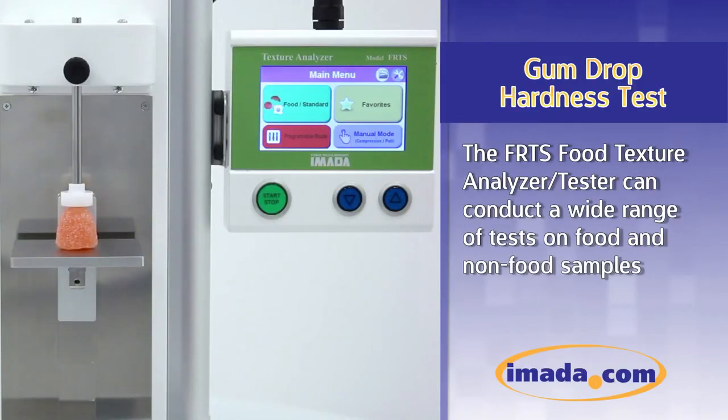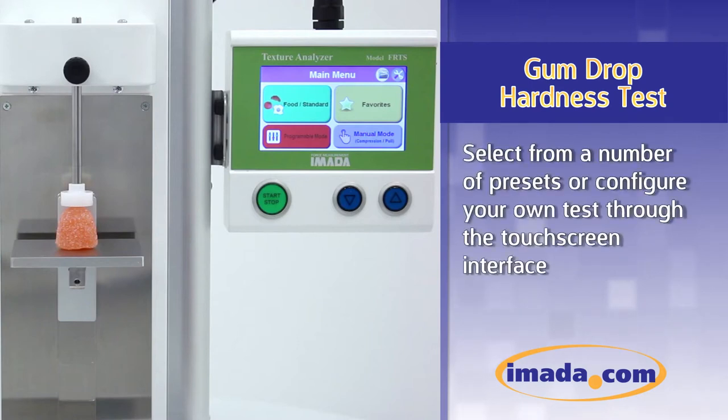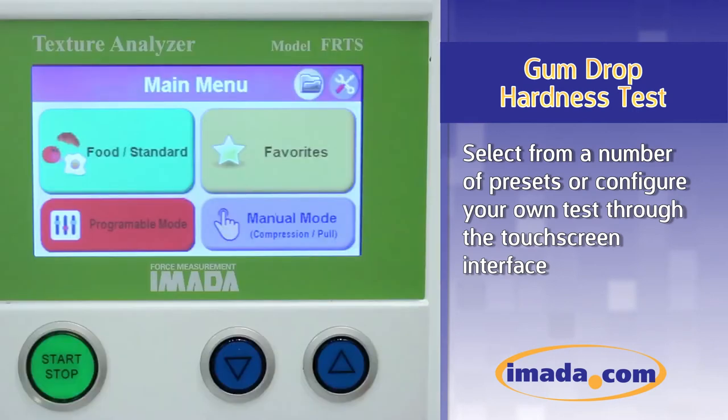The FRTS Food Texture Analyzer can conduct a wide range of tests on food and non-food samples. Select from a number of presets or configure your own test through the touchscreen interface.